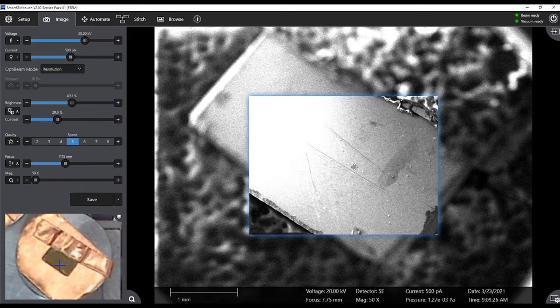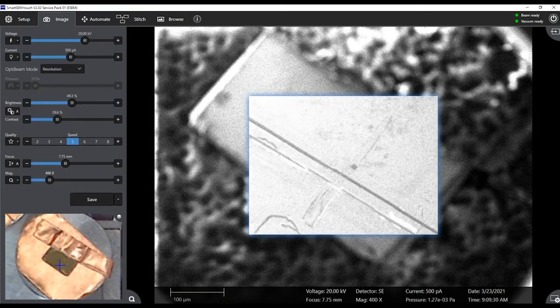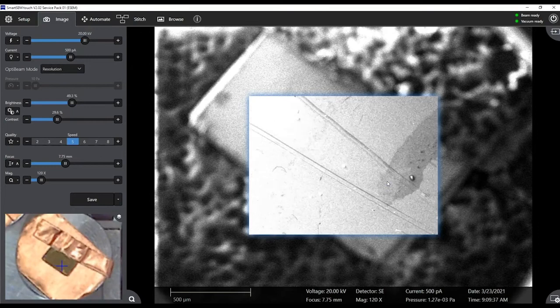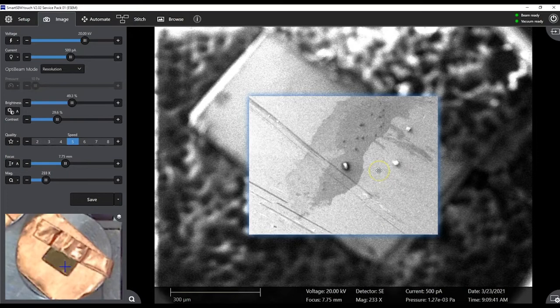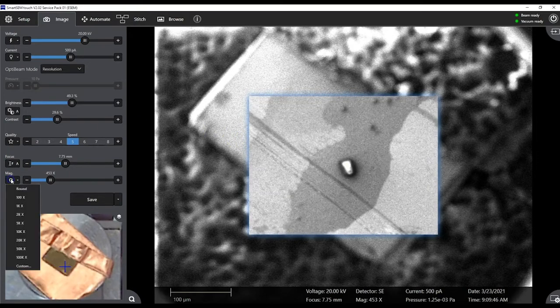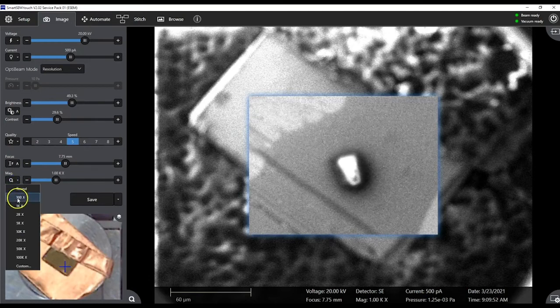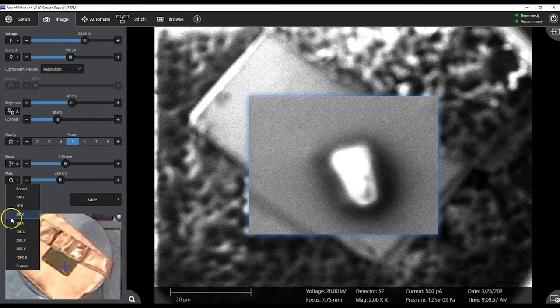We like that one. So what we can also do is increase the magnification and focus in on a spot. Why not right there? Ooh, no, just kidding. I like this spot a lot, so let's zoom into that one. Then we can take this to, say, 1K magnification using this bar on the left. We can also take that to now 2K. About 5K.